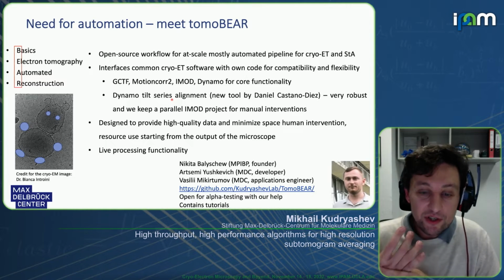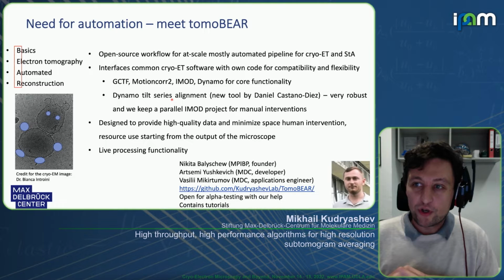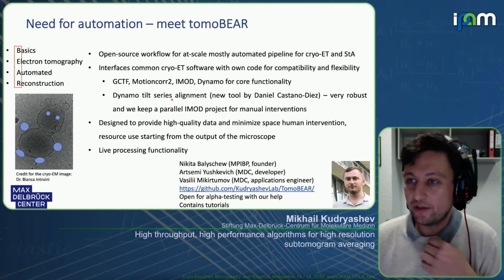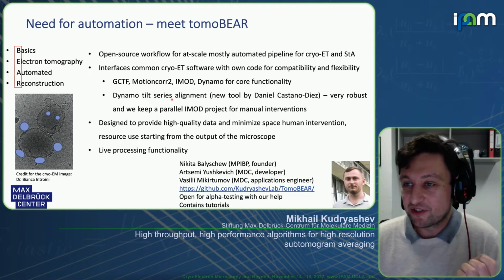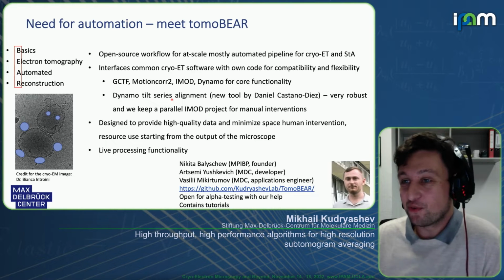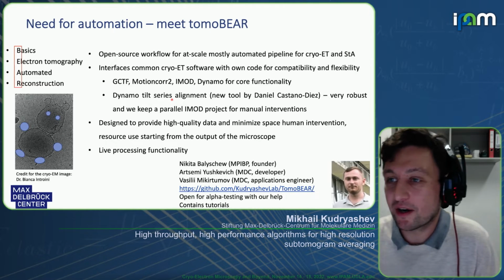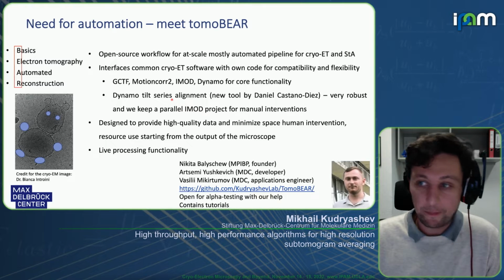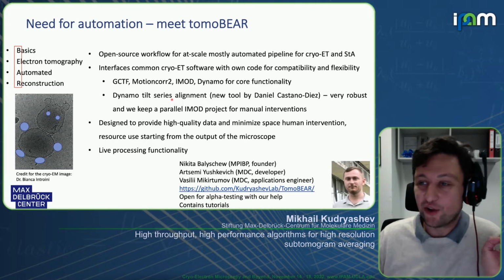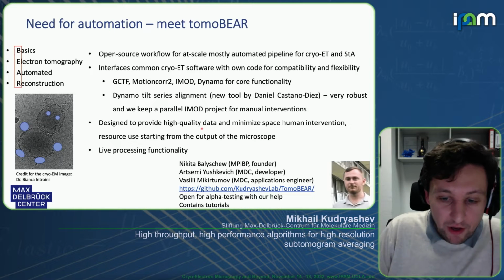He released a new tilt series alignment method, which is very robust and has internal controls, which in our hands actually almost worked well. And the advantage of it is when it fails, it gives us an error message. Right? So we really liked it because this is what you want for automation. If it works, then it gives you a success mark. If it doesn't, it gives you a failure. Right. So, the whole design of this workflow was not to optimize one step, but to optimize all the steps together, and that worked reasonably well.